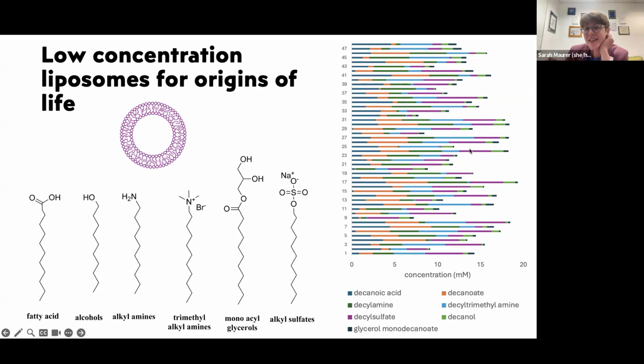In the next comment, there's a comment: I suppose the ML algorithm will need to be able to detect vesicles at all sizes and count them all as positive detection. That's correct. All sizes count as positive detection. Although we could definitely code in their fixed sizes and we know how big they are. So we could very well say, oh, we want to optimize this for a specific size vesicle, and maybe we would be able to get it to be a single size. And there's certainly some compositions that are much more homogeneous than others.